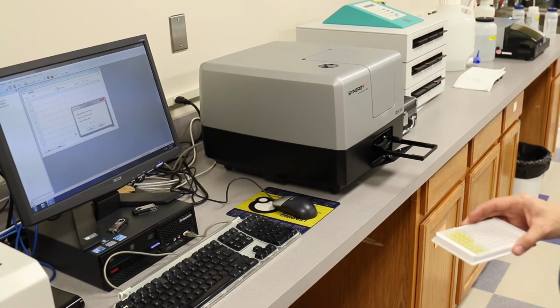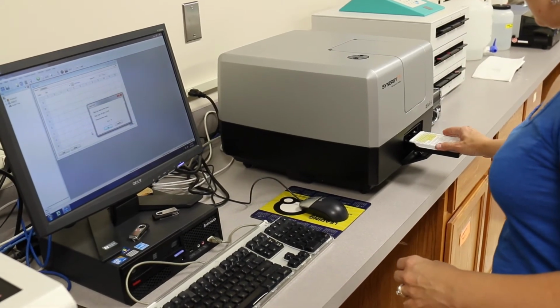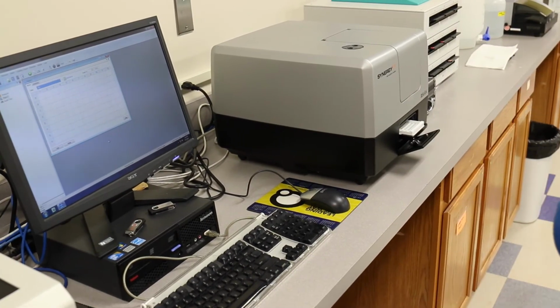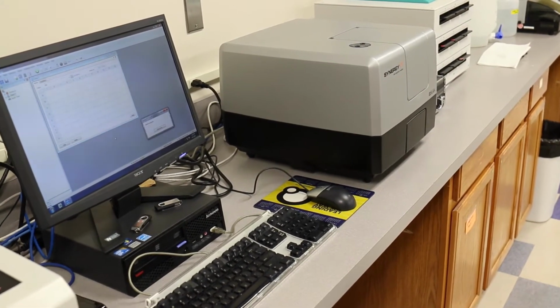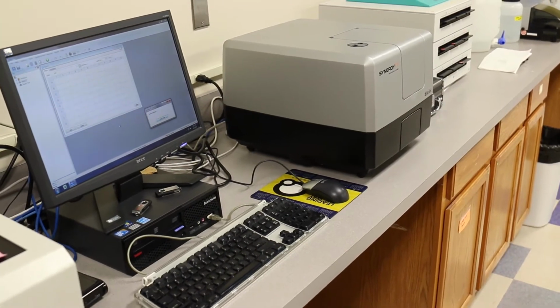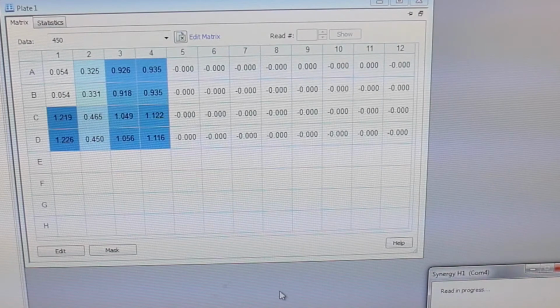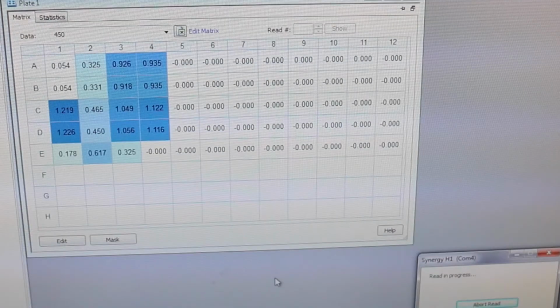Each Arbor Assays DetectX kit requires some type of data analysis to generate a standard curve, correct for sample dilution, or any other sample manipulation that may be required prior to running the assay. The data analysis routine will allow you to correctly determine the concentration or activity of your samples. If you have a plate reader that has software capable of 4PLC curve fitting, you should use that software.